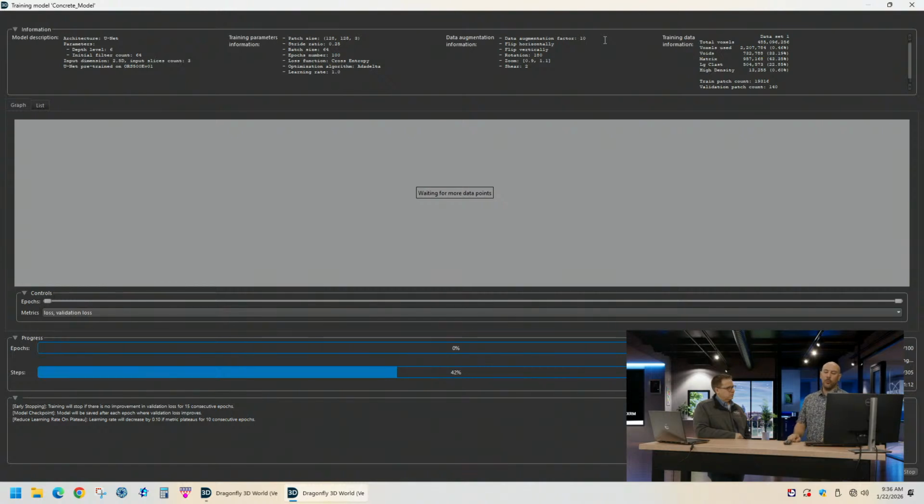And so what it does, it's distorting the image and seeing how the ground truth compares to the data set. And it can help the model learn where the delineation is between the classes. Yeah. So the AI model here is just like a real person, it gets smarter the more things you present it. Right. And humans, we're very visual. Even as babies, we learn how to look at the world around us.